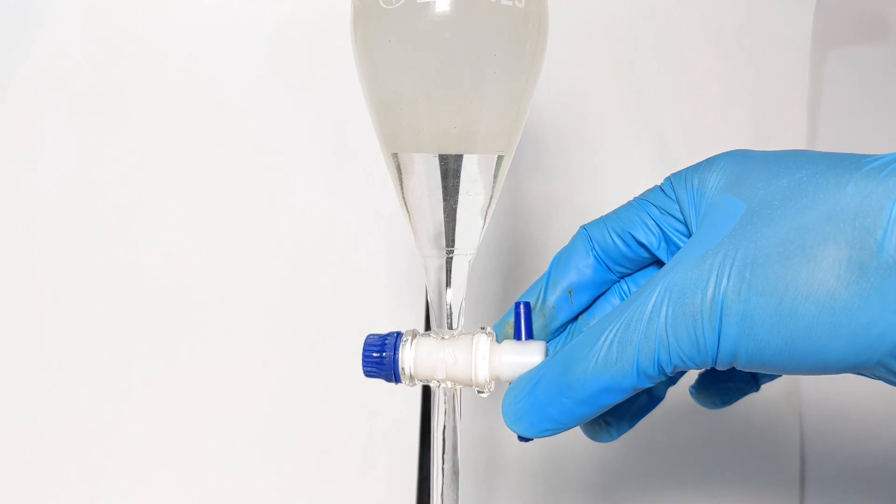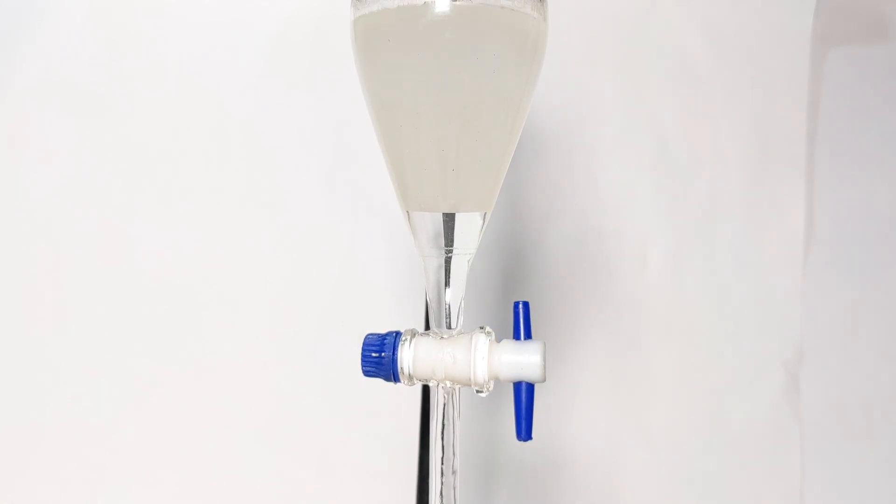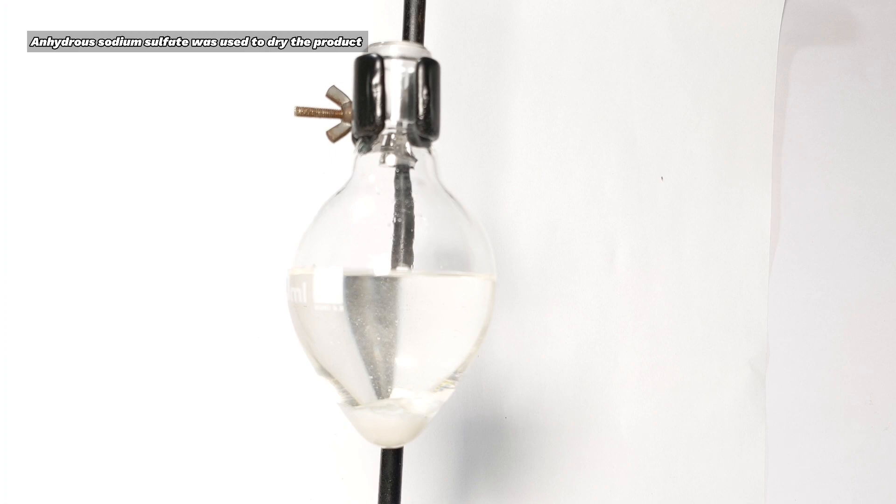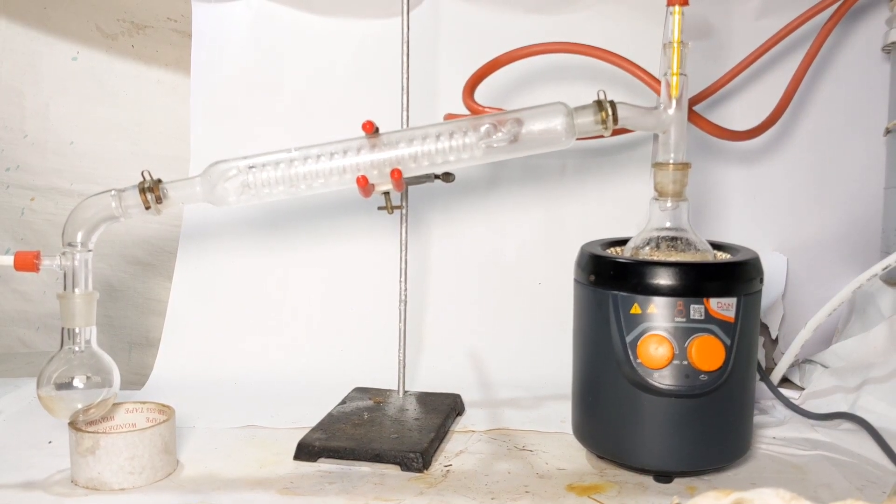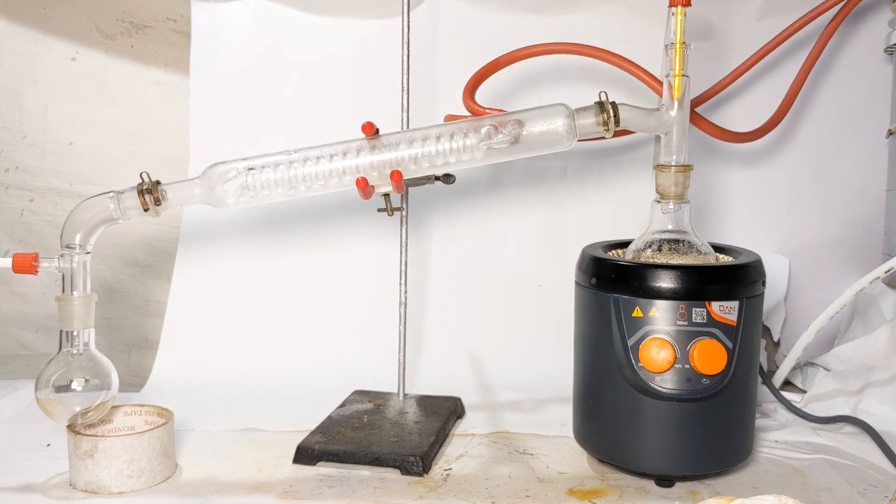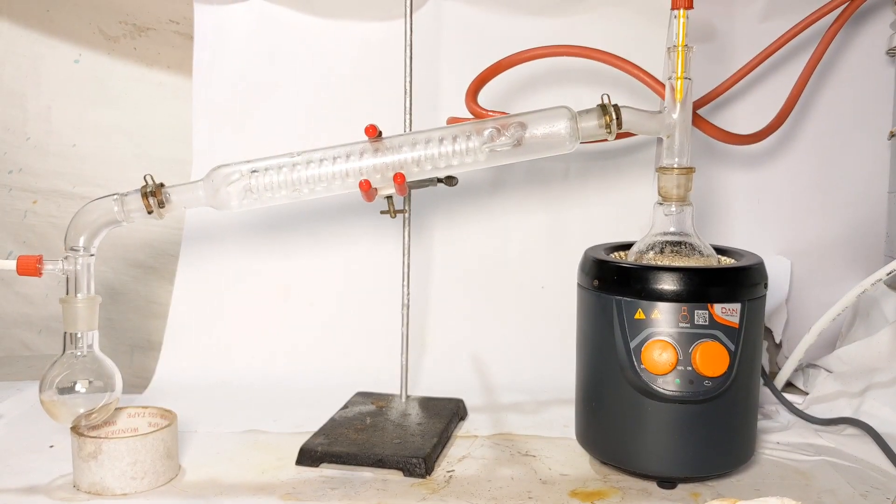The crude product was then dried using anhydrous sodium sulphate and finally we did a simple distillation. Initially some water boiled over at around 100 degrees C and when the temperature rose to around 115 to 120 degrees C, butanol which was left behind unreacted boiled over.